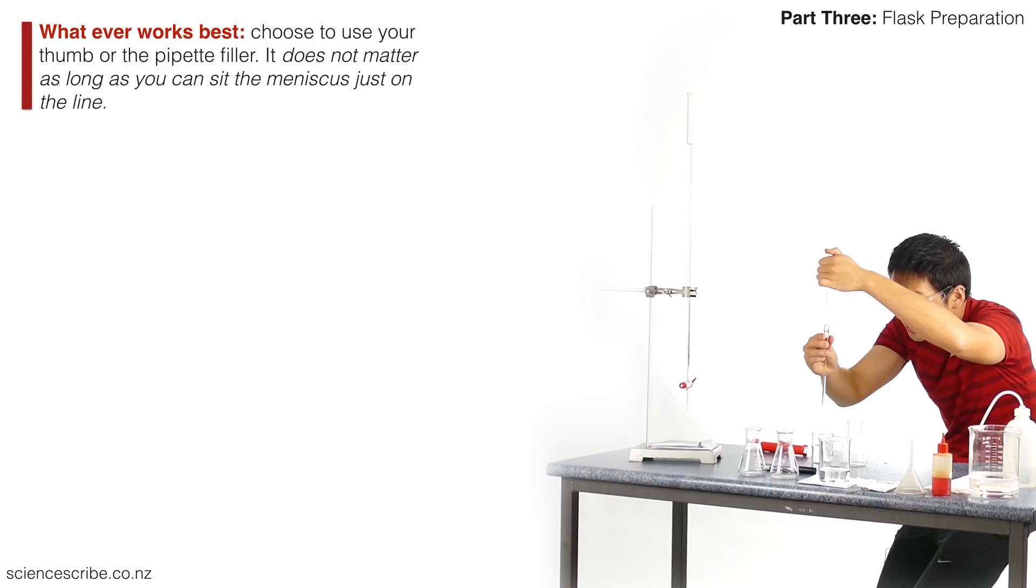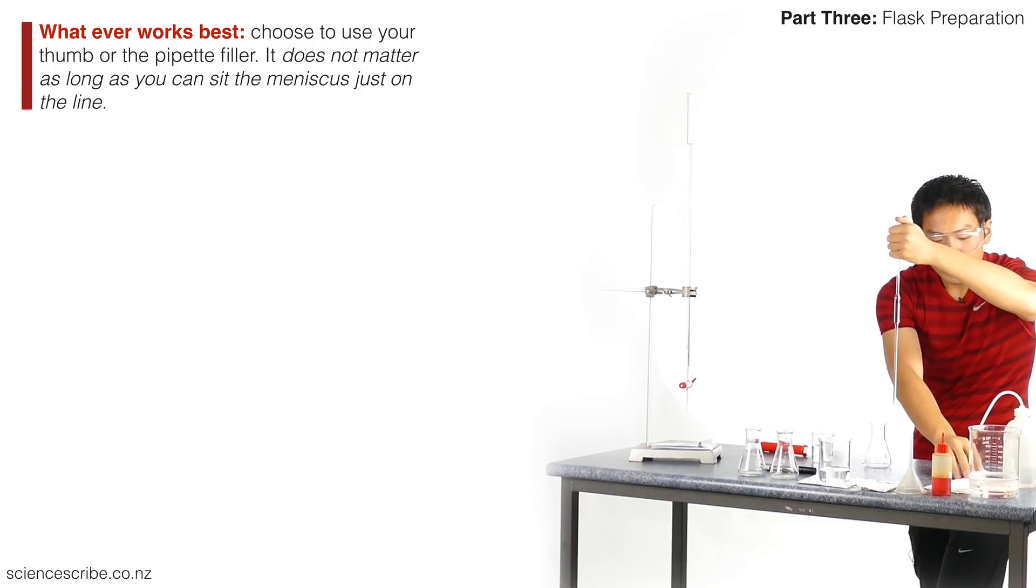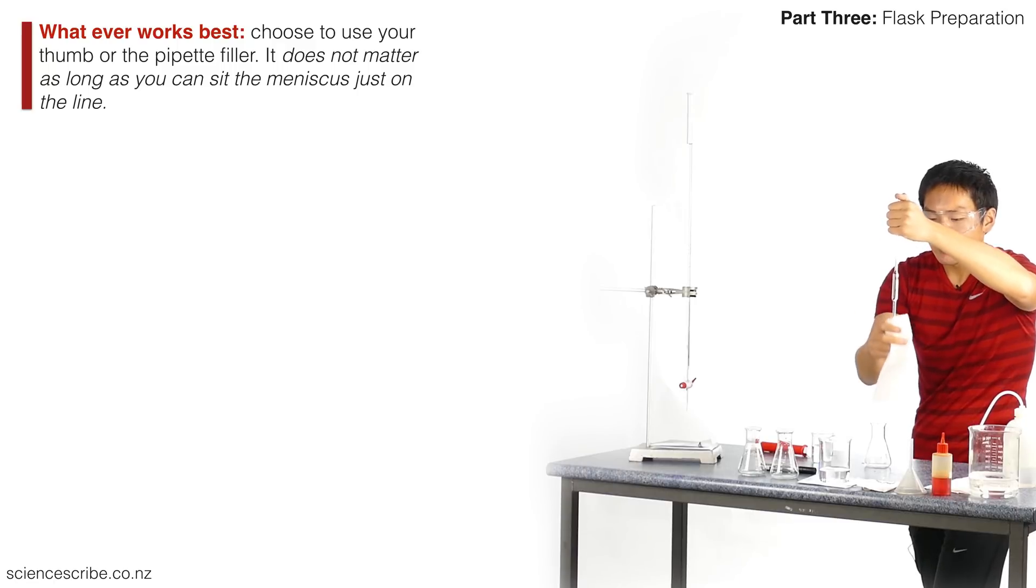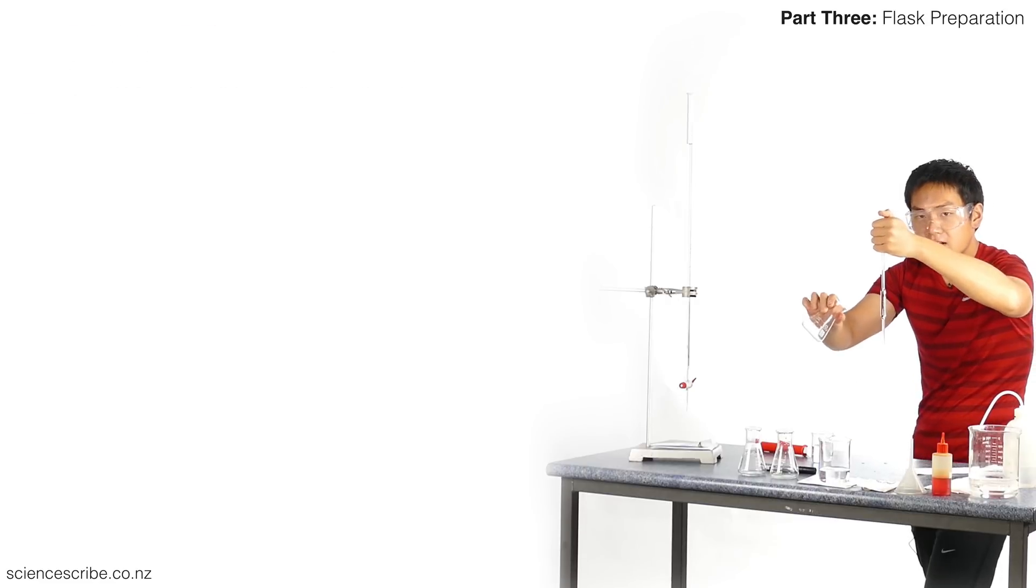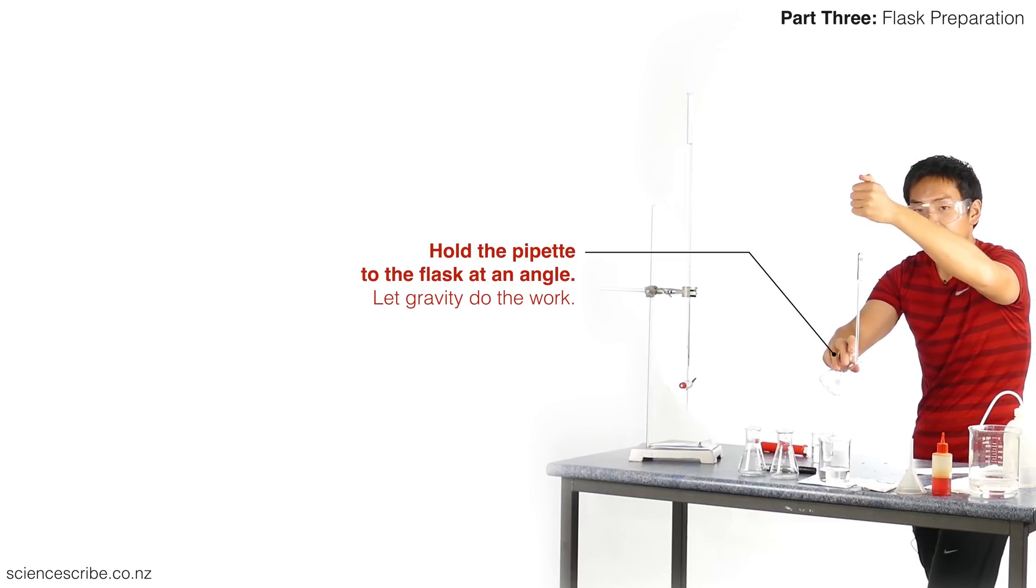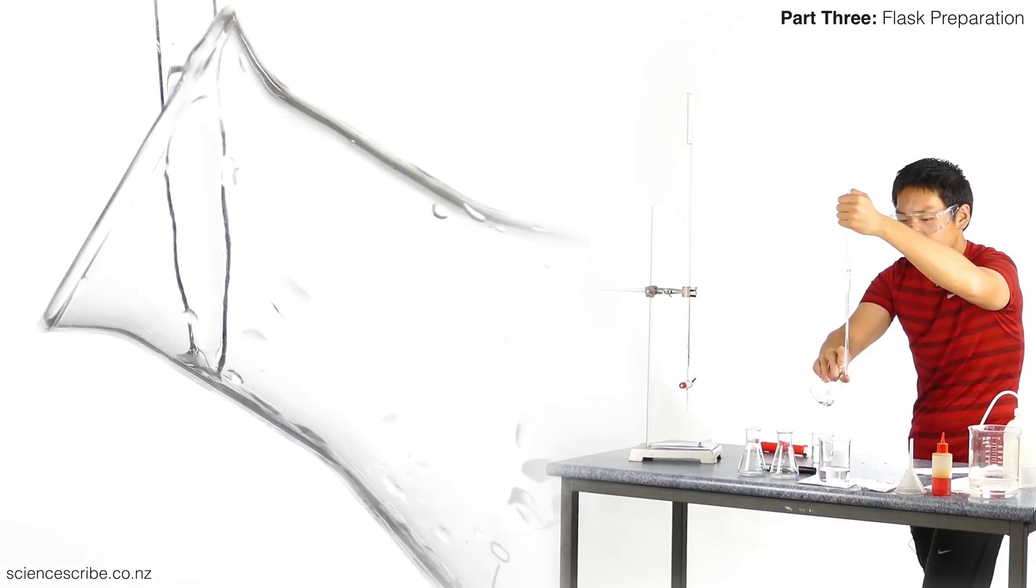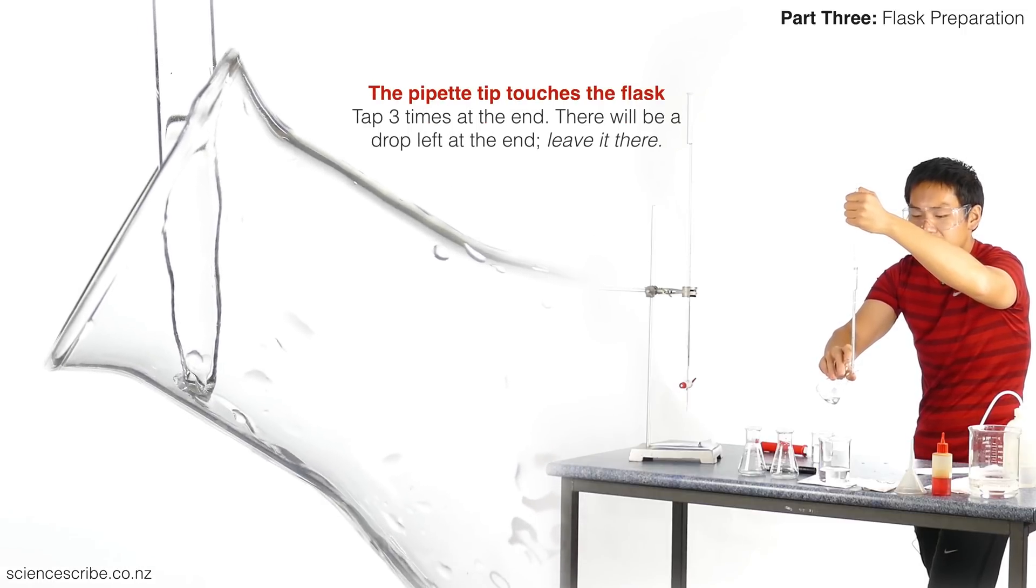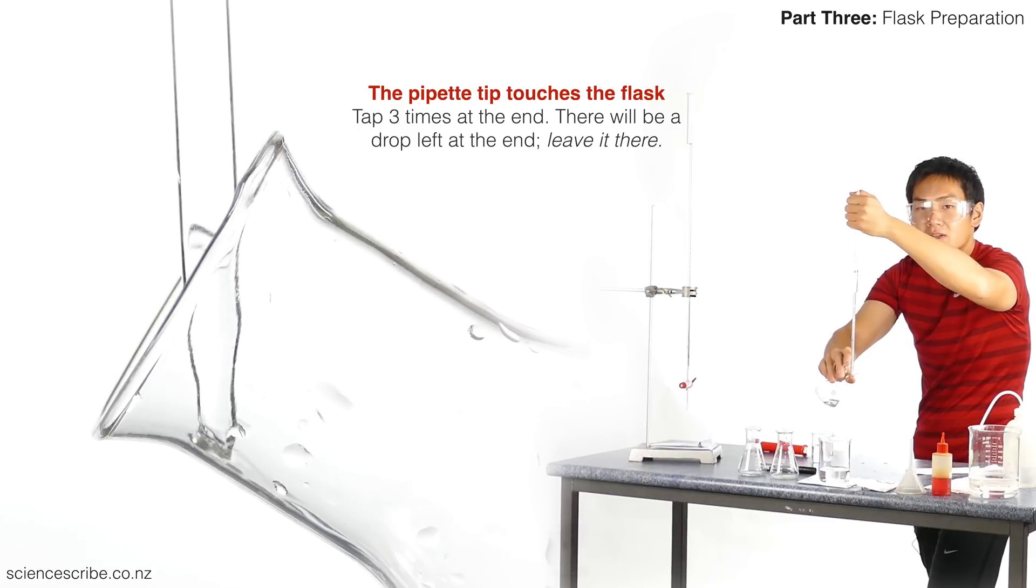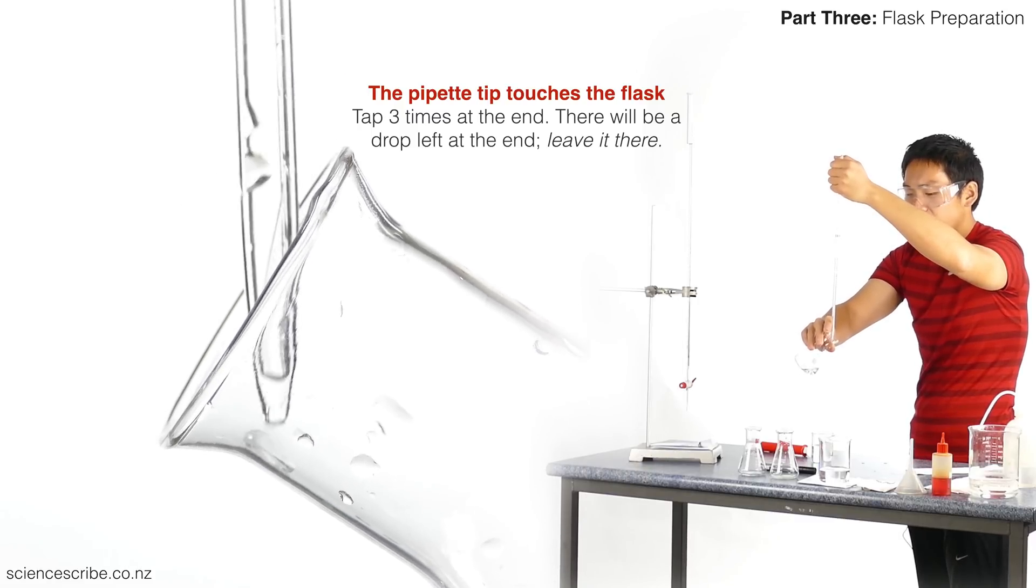We stop. We bring it over to our conical flask. We hold our flask, give the outside a wipe down. We hold our conical flask at a 30-degree-ish angle. We must always touch the tip of the pipette to the wall inside the glass—it has to be a clean wall inside the glass. Then we let it drain. I don't shake my pipette, I don't force my liquid down. I let gravity do all that work for me. You'll notice that as it's draining, there's a little drop left at the bottom. I'm going to tap it very gently three times to that glass: one, two, three.